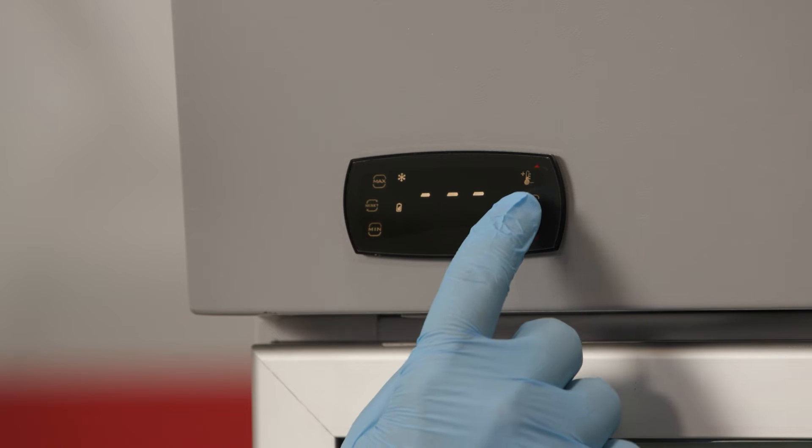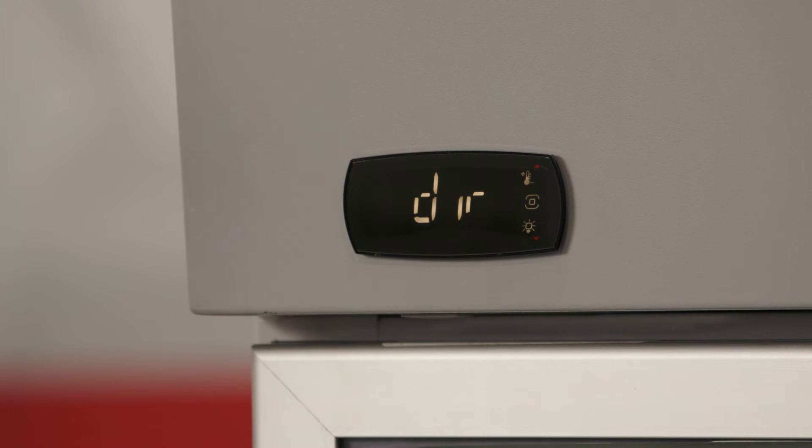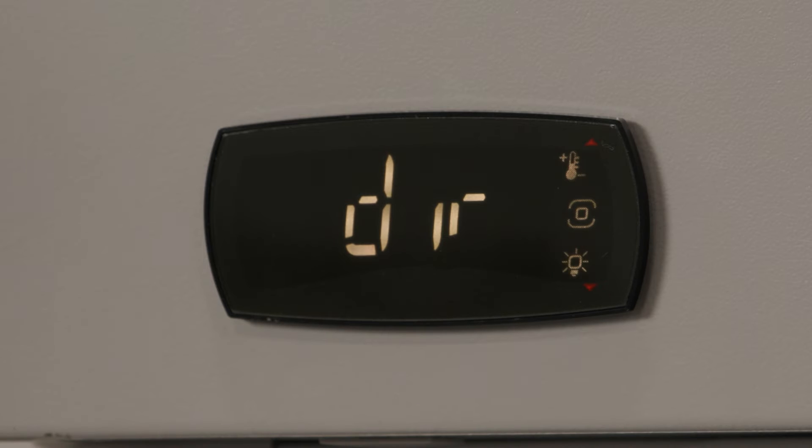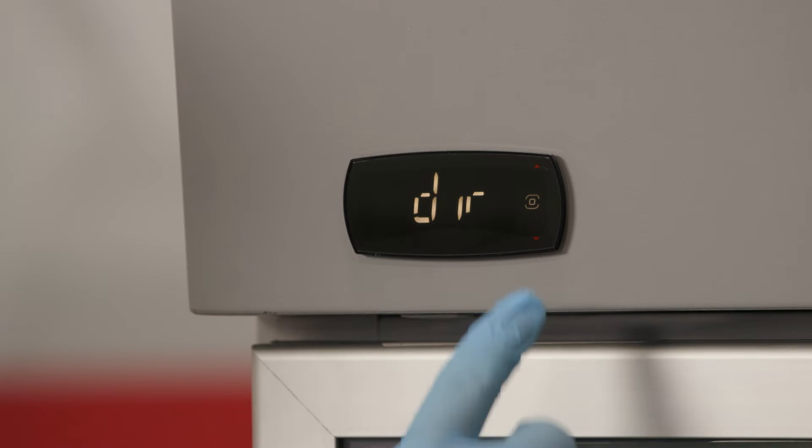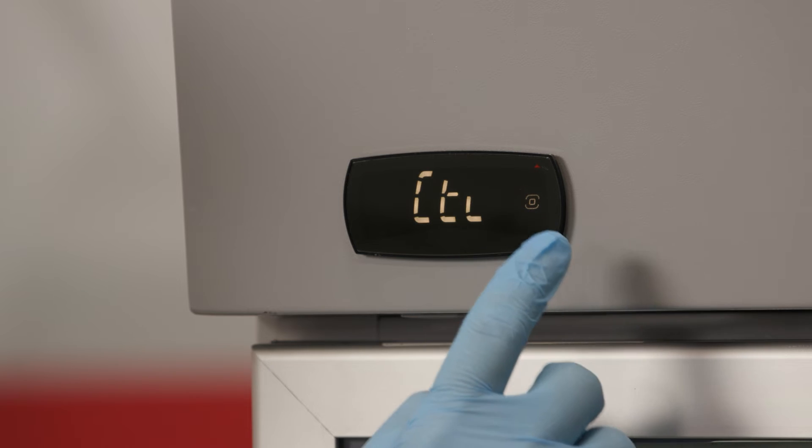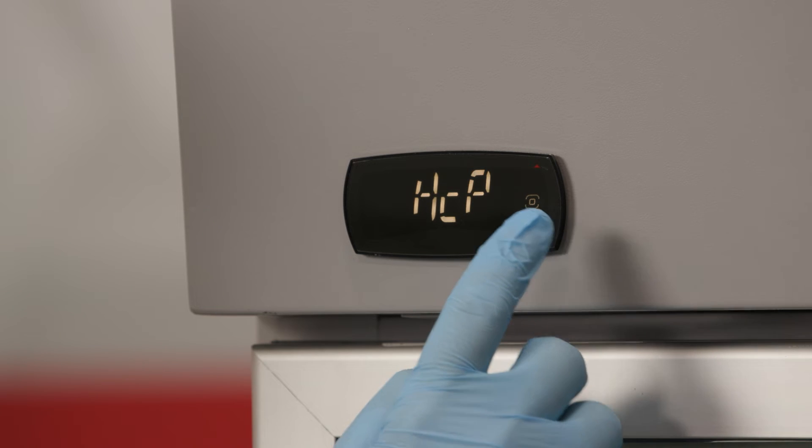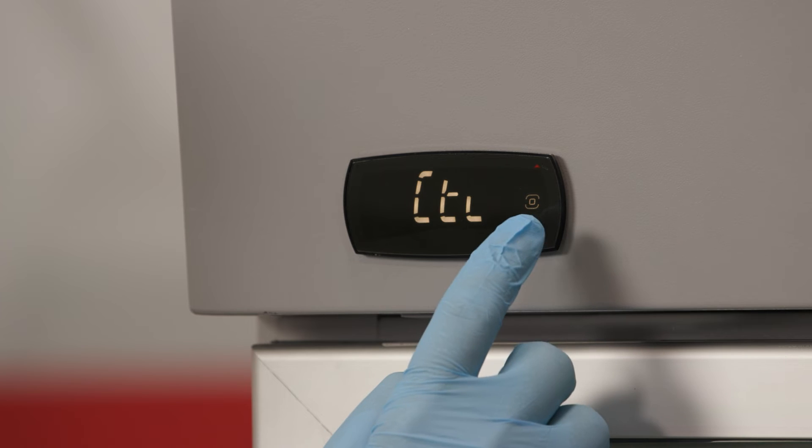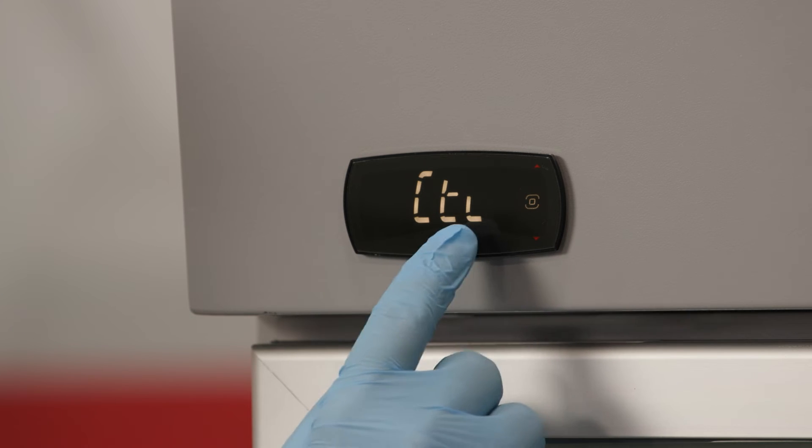Press the program button once more to enter programming mode. The up and down arrow buttons will flash and the DIR or direct functions will be displayed. Use the up and down arrows to scroll through the programming menu until you find CTL or control parameters. Press the program button to select CTL and view the next menu.